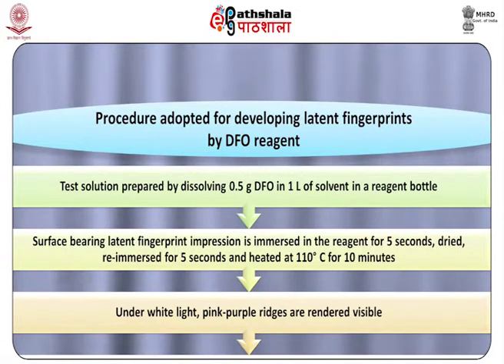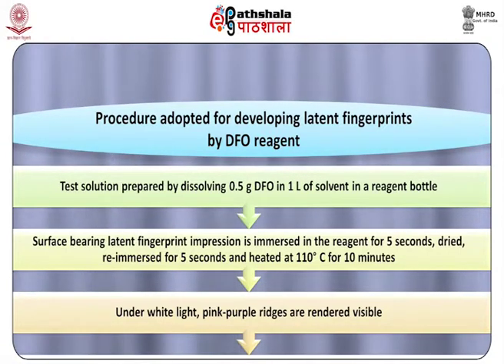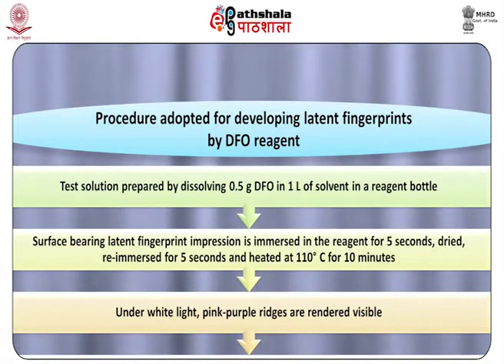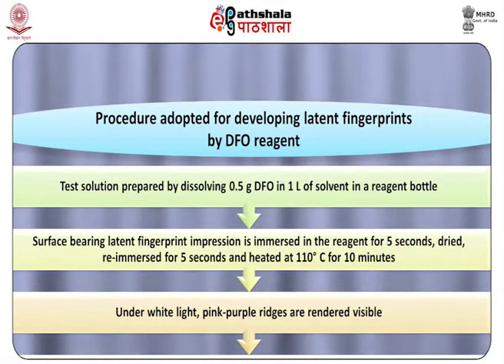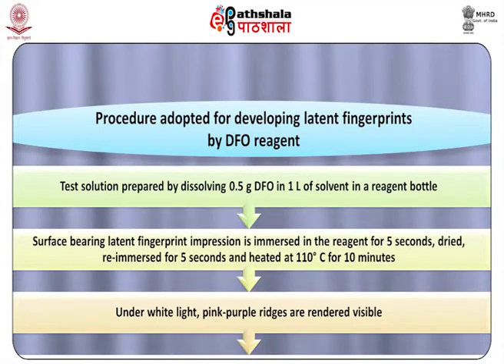The surface bearing the latent fingerprint impression is immersed in the reagent for 5 seconds, dried, re-immersed for 5 seconds, and heated at 110 degrees Celsius for 10 minutes. The heating chamber is shown under white light. Pink purple ridges are rendered visible.